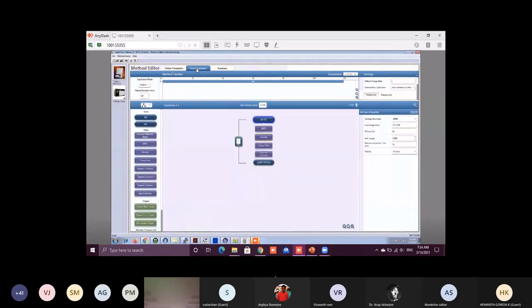You go to the scan parameters. In the scan parameters, these are the basic parameters which are generally used. There are various options starting from MS, whether you want to do a full scan or selected ion monitoring, whether you want to do MS mode or DIA, which is used for the targeted workflow, and various other sub-parameters which can be used, such as the target mass used in DIA, meaning data independent acquisition.